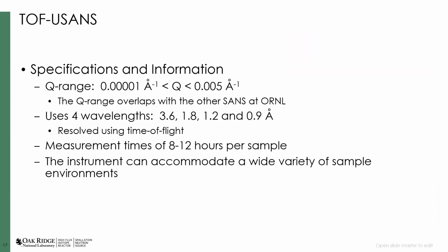And at the moment, someone who proposes to use the time-of-flight USANS can also just tick a little box in the proposal system and say, I would also like SANS. And we've been generally accommodating those measurements on the EQ-SANS. And that seems to be a really popular way that people can get SANS and USANS. So the mechanism is limited to getting SANS data on the samples that you measured with the USANS. And we usually can do that within about a day.